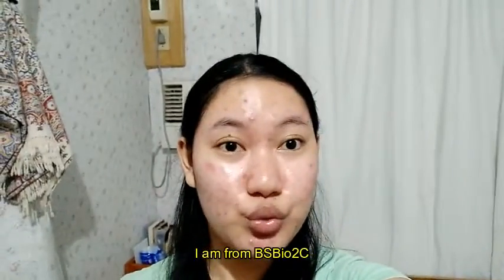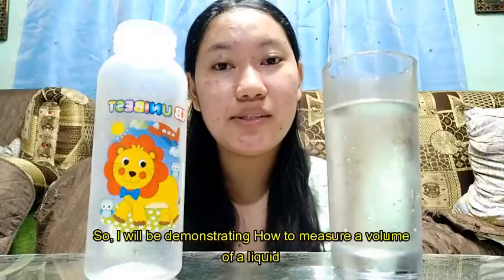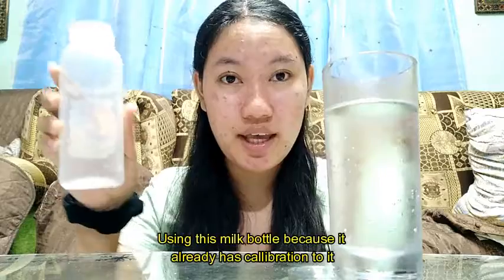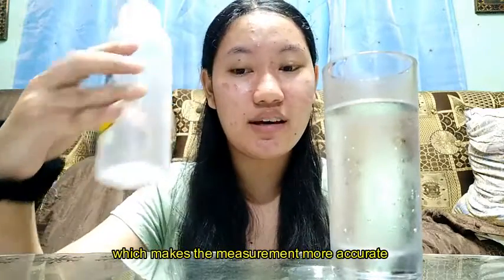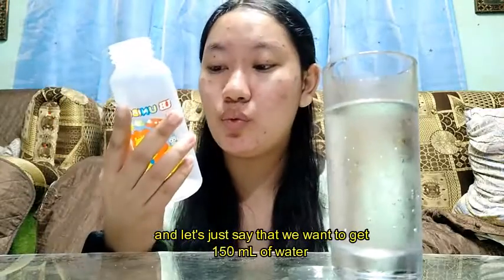Hi, I'm Jan Marielle Iming Cote. I am from BS Bio 2C and I will be demonstrating how to measure a volume of a liquid using this milk bottle, because it already has calibration markings, which makes the measurement more accurate. This bottle is 250 ml.